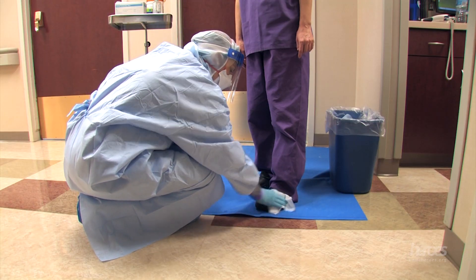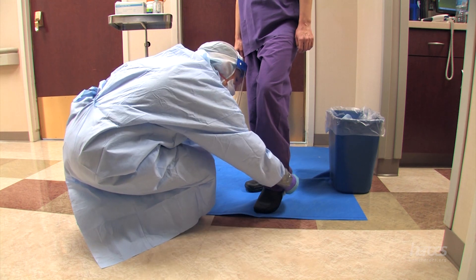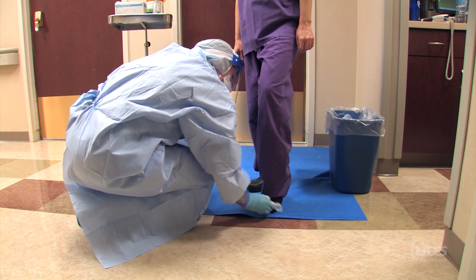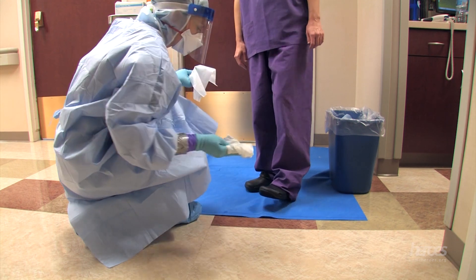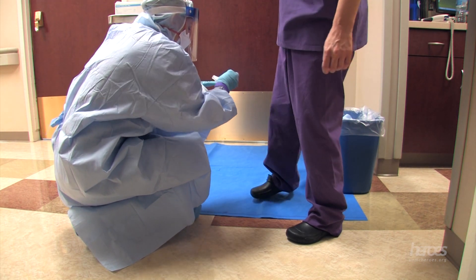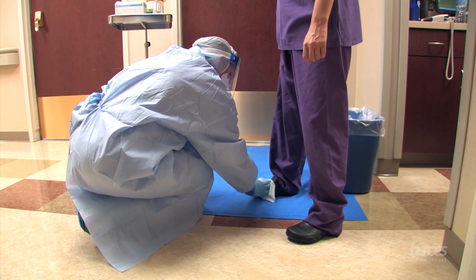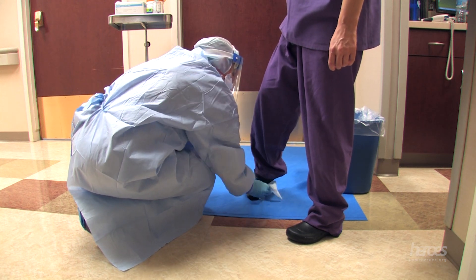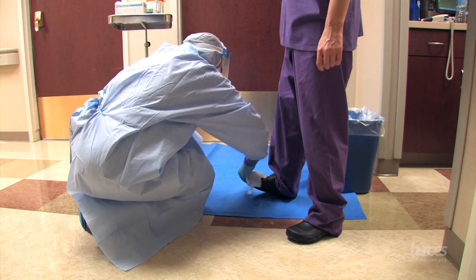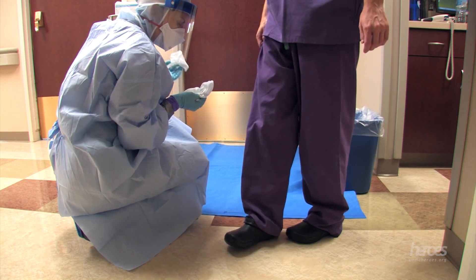The doffing partner will bleach wipe the top and bottom surfaces of your plastic footwear before it touches the clean floor. The doffer can now step off the doffing pad and onto the floor.